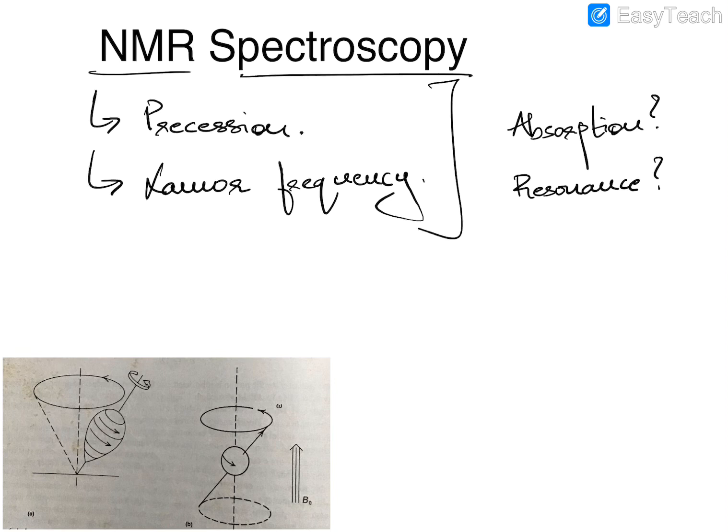And both these questions will get answered when we look at the way a nucleus behaves in the presence of an external magnetic field. So when an external magnetic field is applied, not only does the nuclear spin get established, but apart from it undergoing a spin motion, it also performs something called a precession, like that of a spinning top under the influence of gravitational force. Now this precession happens with a characteristic frequency, and this frequency of precession is called the Larmor frequency over here.